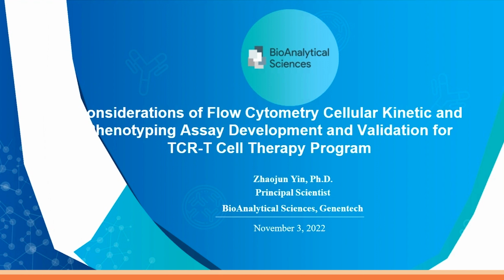Today, I will present flow-based cellular kinetic and phenotyping assay development and validation for TCR-T cell therapy program. Probably many of you have learned about this type of assays for CAR-T program from either webinar, conference, or publications. In my talk today, I will highlight some considerations in assay development and validation for TCR-T programs.